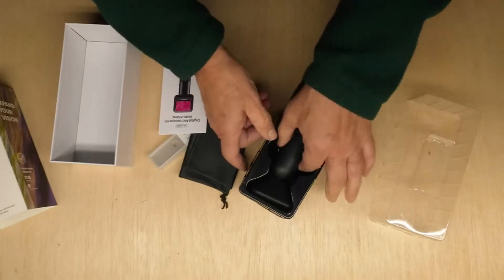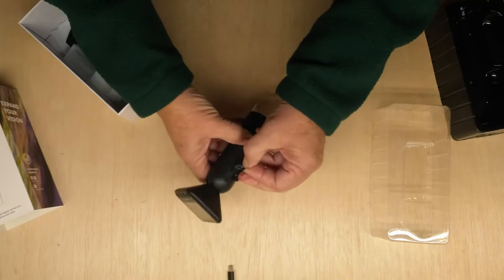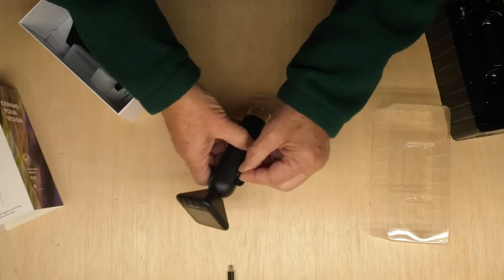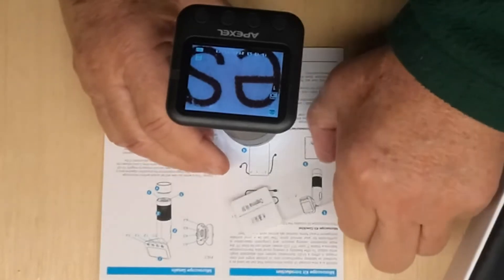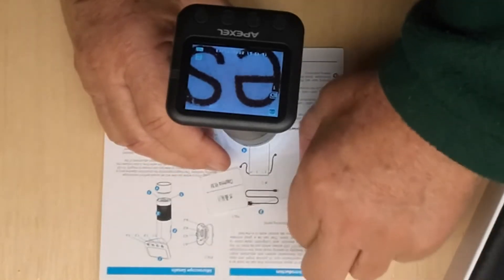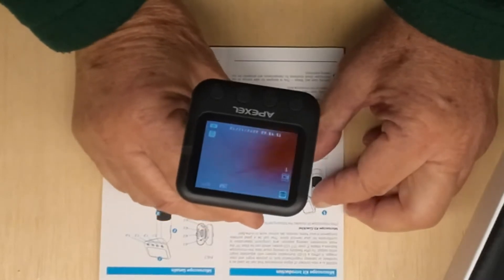Here's the microscope. It's nice that they include a 32 gigabyte TF or micro SD card. It comes with some nice little slides — this is a daphnia, I think that's a flea of some sort.